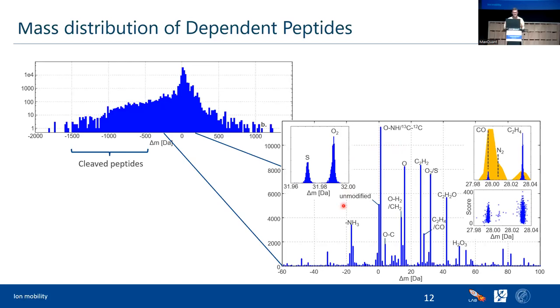Jürgen will talk more about it later, but this is how library mode in DIA is performed. You first run DDA analysis, get this spectrum library from DDA analysis, and you supply this library into the DIA analysis. And you always choose either library mode or discovery mode, but both of those modes generate libraries with intensity information, and this is crucial for DIA analysis.